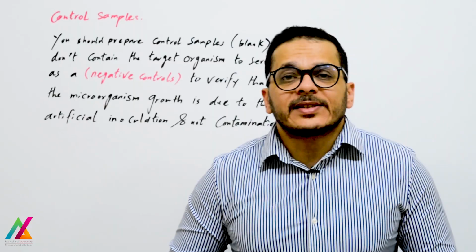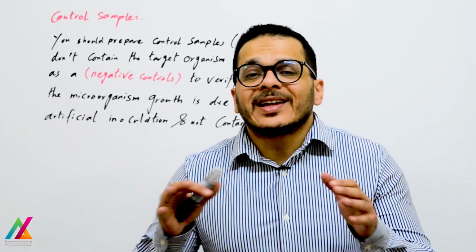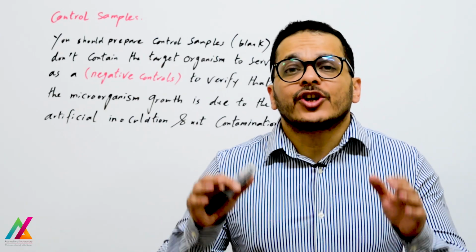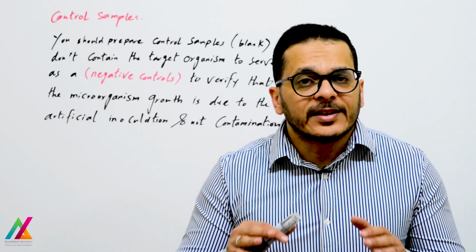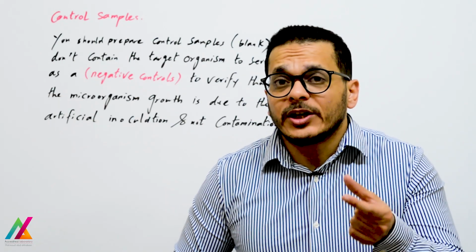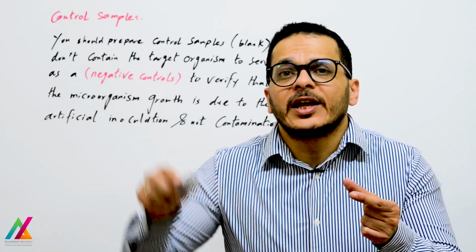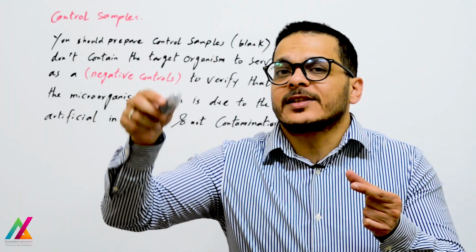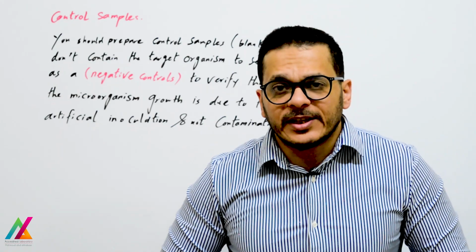We also have this in chemical analysis, the blank sample, which doesn't contain the target analytes and shall be run with every sequence to ensure that there is no contamination. If there is any contamination during the process, that will be subtracted from every positive sample, and also from the spike sample or whatever sample will have a result during this sequence.